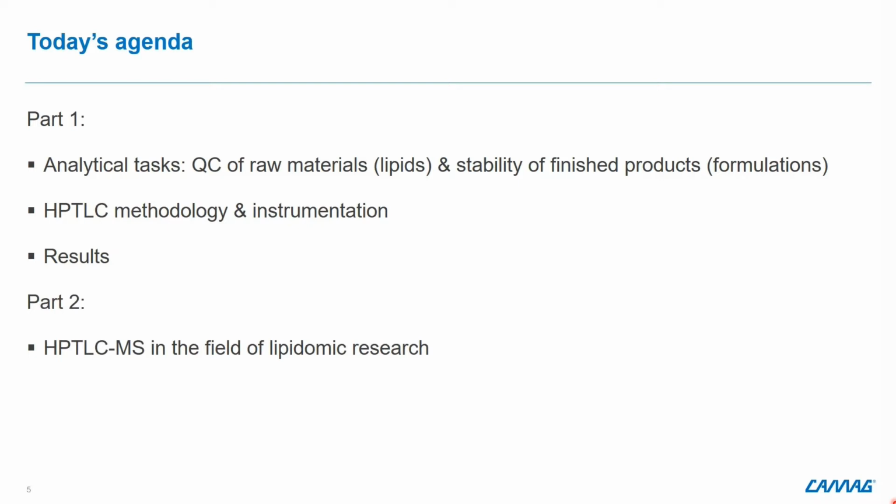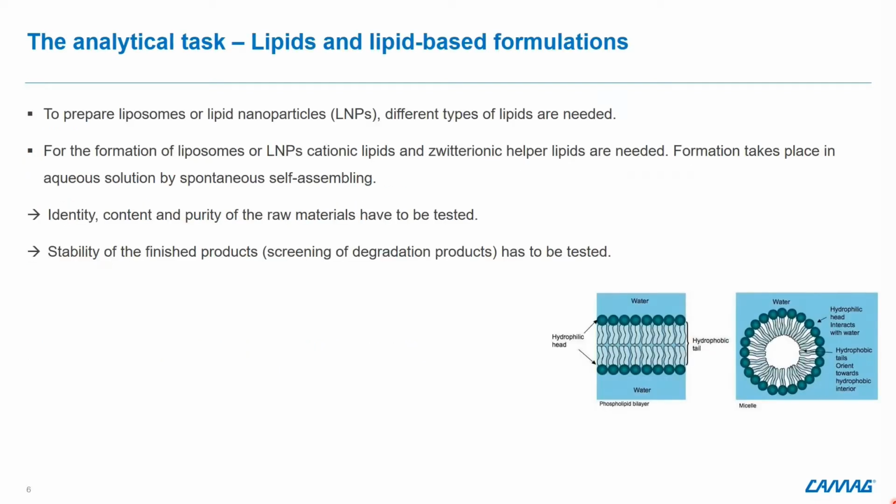In the second part, I would like to give you an overview about the use of HPTLC coupled to mass spectrometry in the field of lipidomics. The main topic is the analysis of lipids and lipid-based formulations.